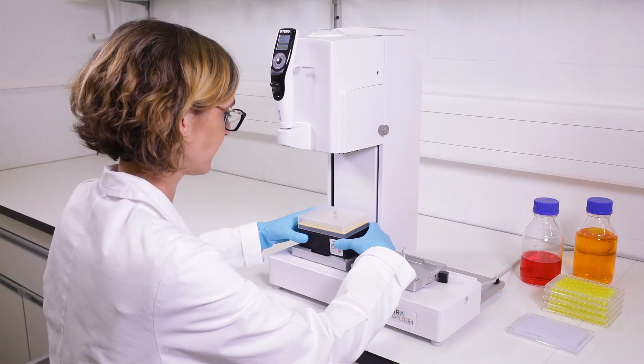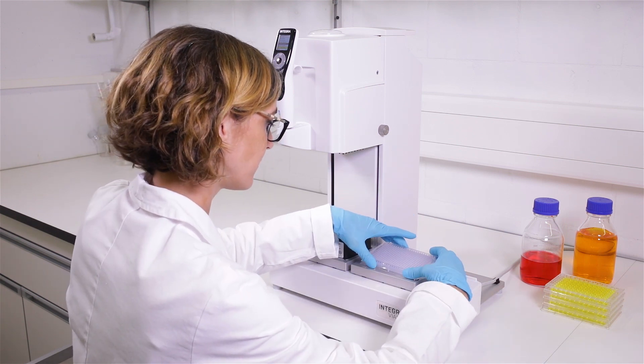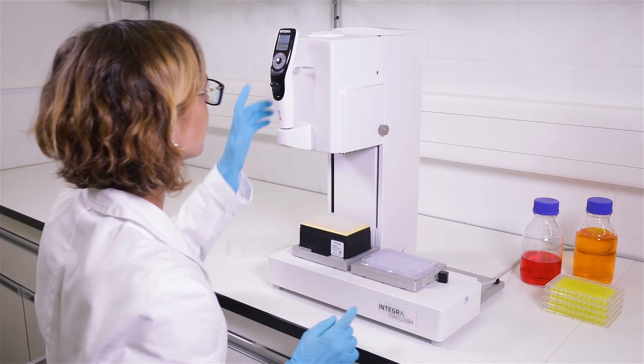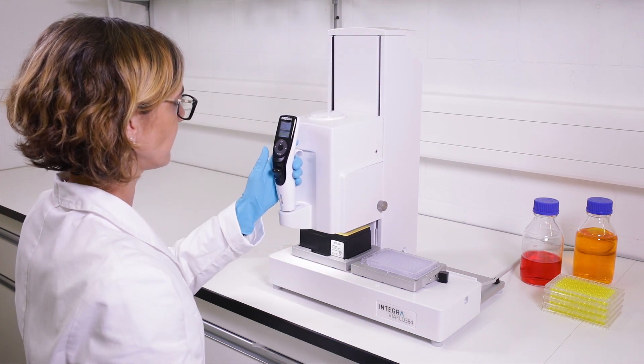Thanks to our well-proven grip tip system, the pipetting tips will never loosen, leak, or fall off. Tips are loaded electronically by the simple push of a button.